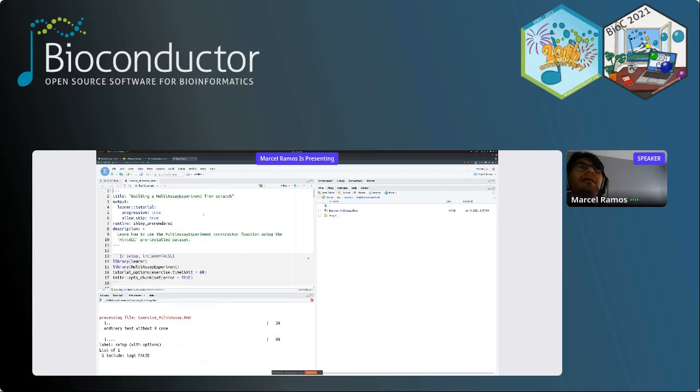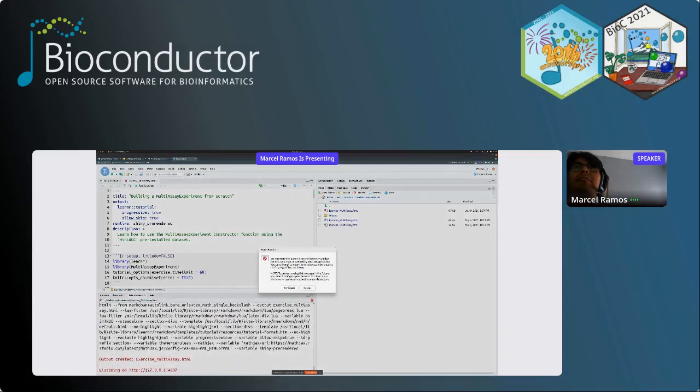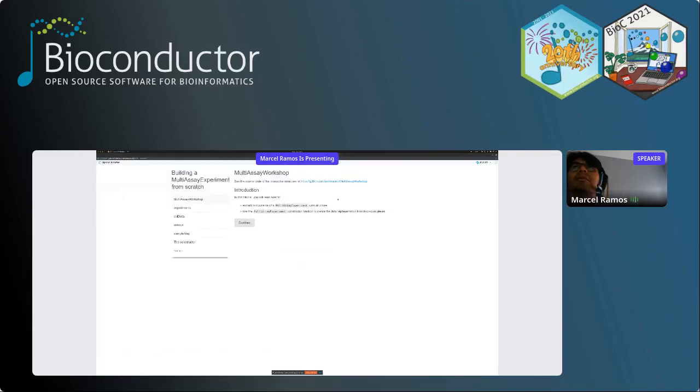And we'll get a pop-up. If your browser does not have pop-ups enabled, you can make an exception here to see that pop-up. See, I got the notification here. On the top right, I can click on Always allow pop-ups from this website, then click Done, and then try again. And then I'll see the little window show up here.